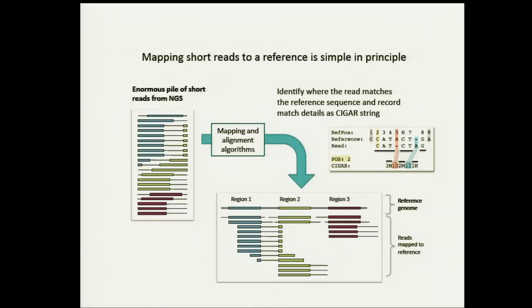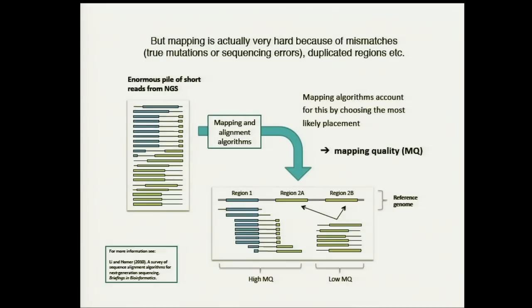So in here, you're seeing both the mapping and the alignment. The mapping will just find the best position of that short read onto the genome. And then once you find that position, you will try to align it as best as possible. What happens here, and I'm going to come back to this slide, is that the reads are not perfect matches to the reference. We all have SNPs. We're all different from the reference in many ways. We have regions that just don't match the reference at all, other regions that have a few variants that are kind of making the placement difficult.